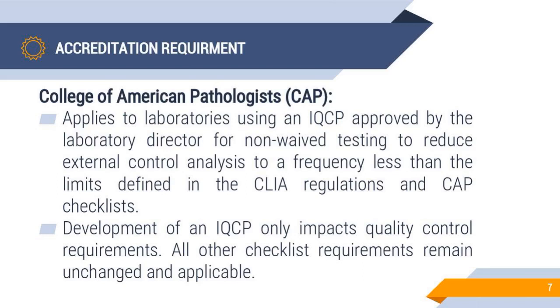Here is where the confusion always comes from the lab people. They always ask when I can use or should do IQCP. IQCP applies if you are performing a non-waived test with less than the CAP or CLIA requirements, which is usually, at a minimum, running 2 levels of quality control for each non-waived test with a frequency based on the manufacturer instruction or accreditation requirements.